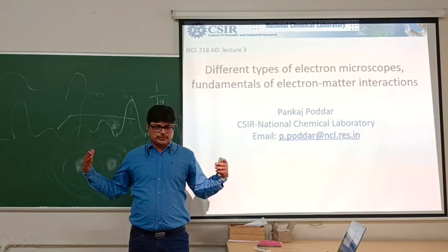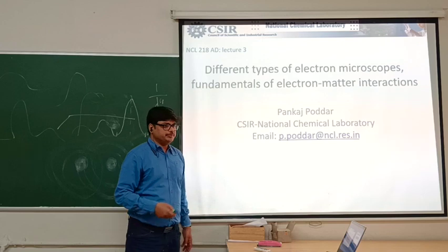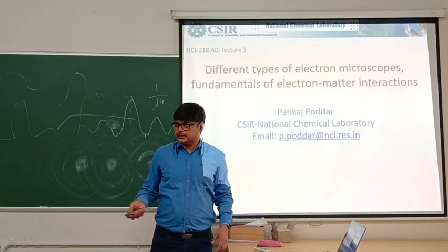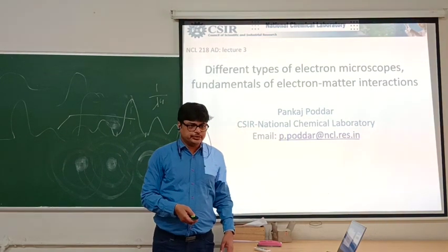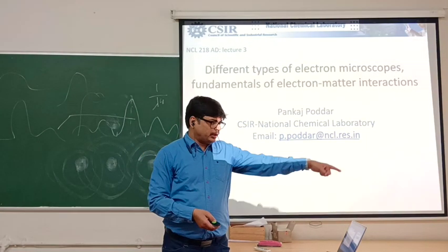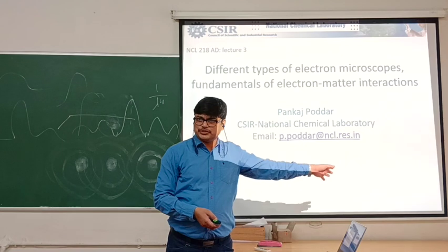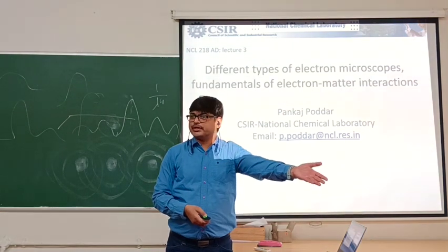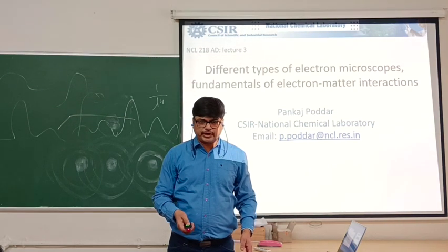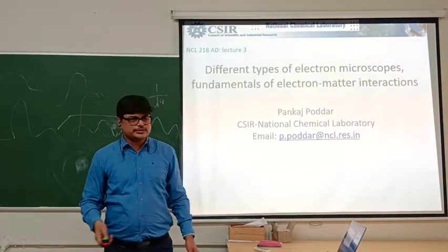Imaging the sample means, suppose you use a convergent beam instead of this kind of beam. It's harmless, I am just pointing at you. For example, this is the sample, and I am shining the electron beam on him. He is an atom, so I am shining the electron beam on him and getting those high angle scattered electrons. I capture that, and it will tell me what kind of atom he is. Then I move to him, and to him. Here I will not find any atom. So I can scan.